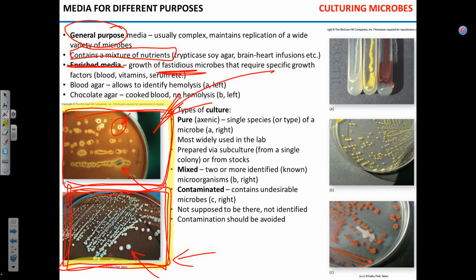So microbes, if they get in the bloodstream, will not just start to grow, because you add iron and microbes, they love it. Almost all of them love it. I mean, they grow much better on something that contains iron. Neisseria must have it to grow. You see? So that shows you the example of enriched medium compared to the general purpose.